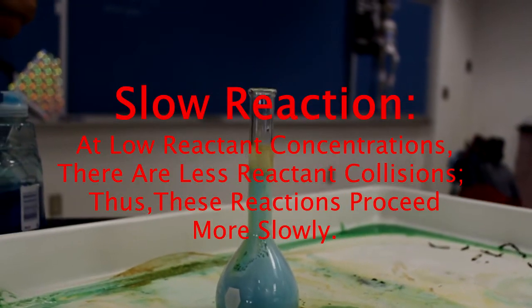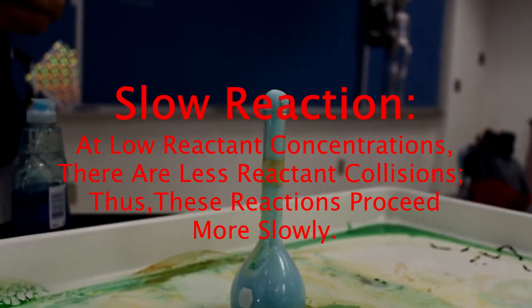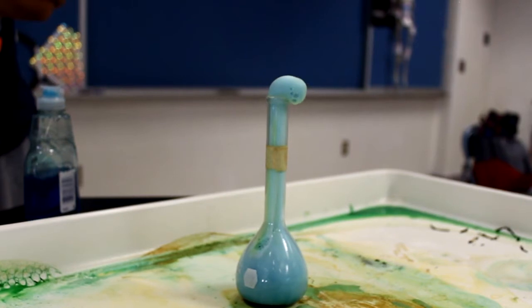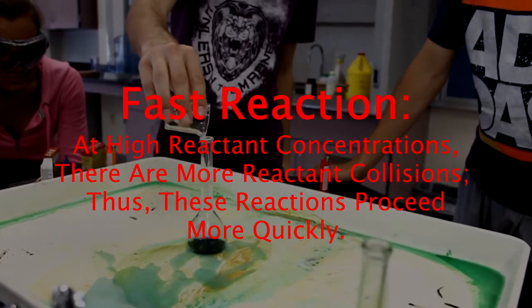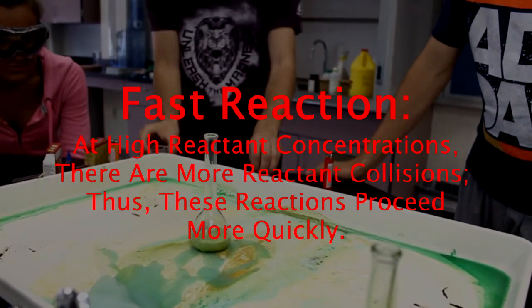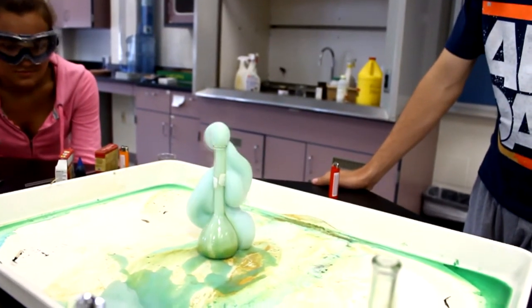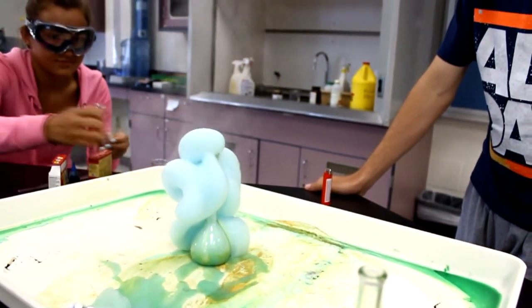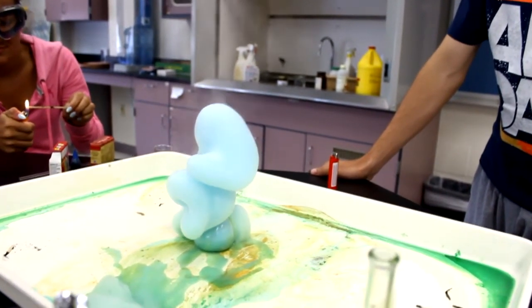In the slow demonstration, we're using 3% hydrogen peroxide, which means that the concentration of the H2O2 is very low in the solution. Next, we're going to be using 30% hydrogen peroxide, which means that the concentration of the H2O2 in the solution is much higher. Therefore, there are more hydrogen peroxide particles able to interact, meaning the reaction happens faster.